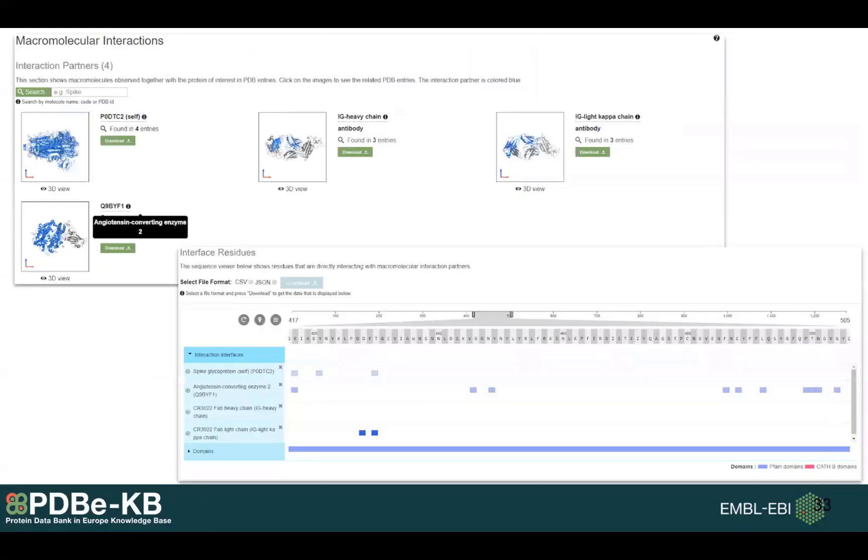We have the similar setup for macromolecular interactions. Again we have a gallery. If this interaction partner has a UniProt accession, you can actually go to its own aggregated view page. And again we are showing which residues are involved in interactions, basically showing you the interaction interface.